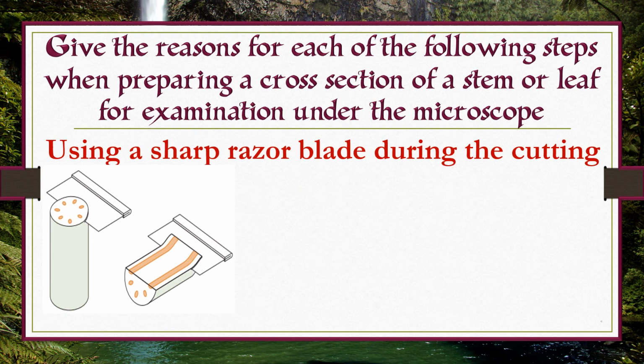Using a sharp razor blade during the cutting.